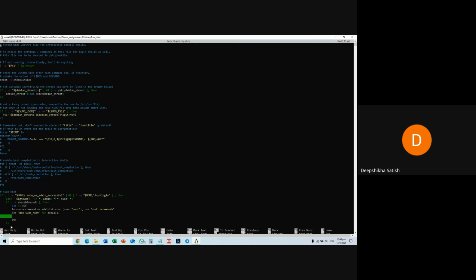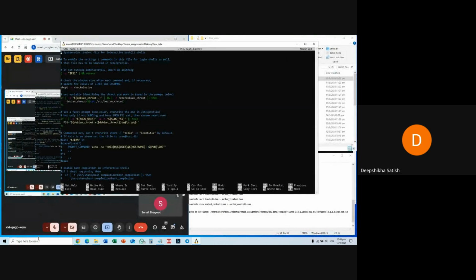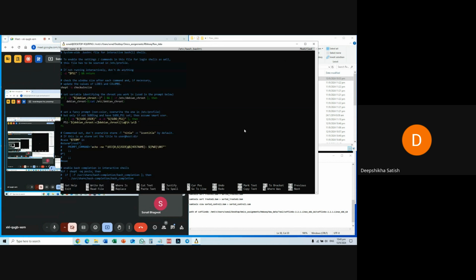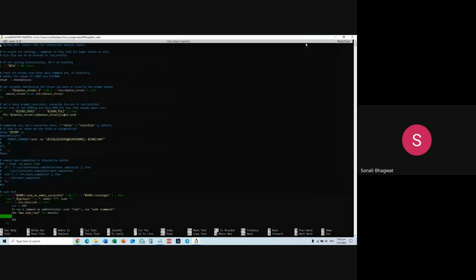Can you just maximize this? Yeah, this is the F1. Go down. Can you see this F1? Yeah, just enter. Hello? Yeah, just a minute. When I enter, it is going up to the first line.